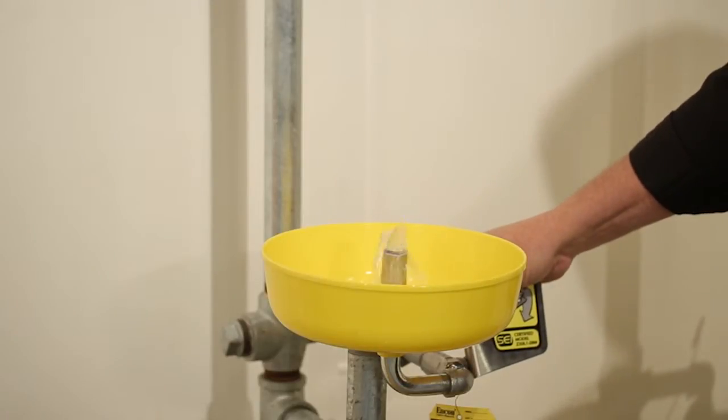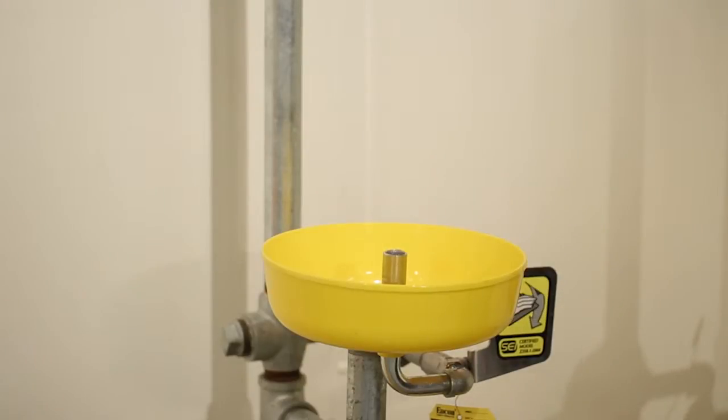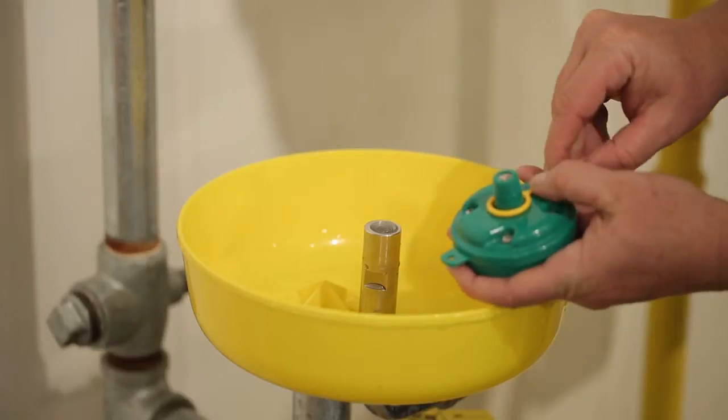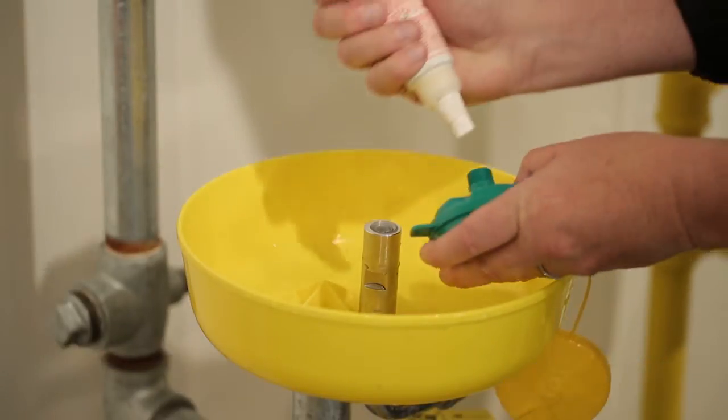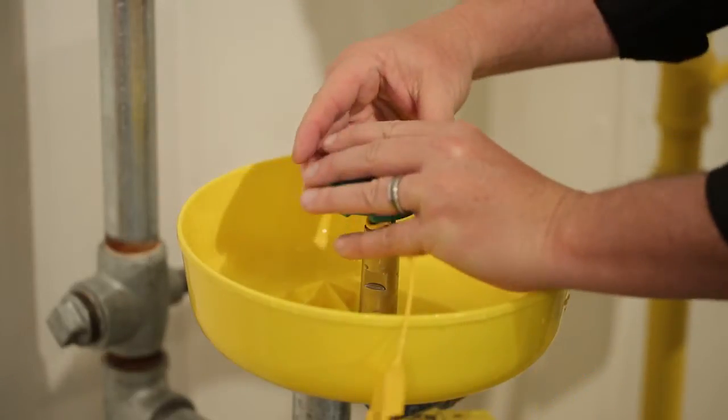You will need to flush the system prior to installing the AXION head. To do so, activate the water source and let it flush to ensure all debris is removed. Once flushed, place the AXION i-face wash head nipple through the dust cover loop. Apply appropriate sealant to the nipple and twist clockwise onto the adapter.